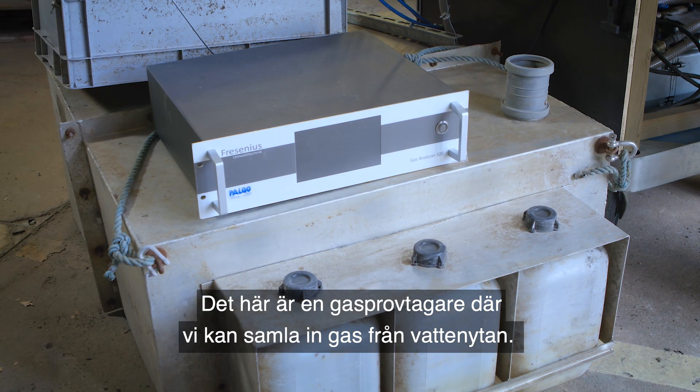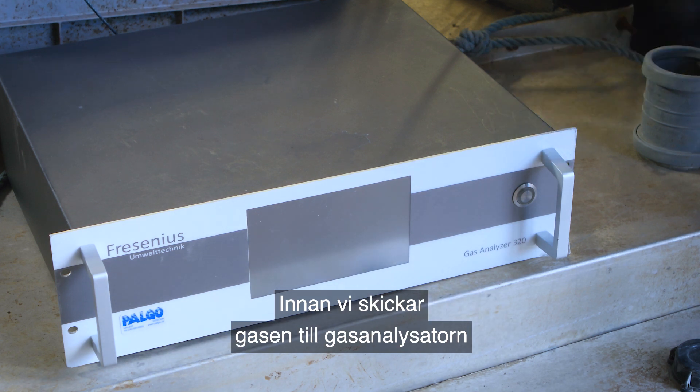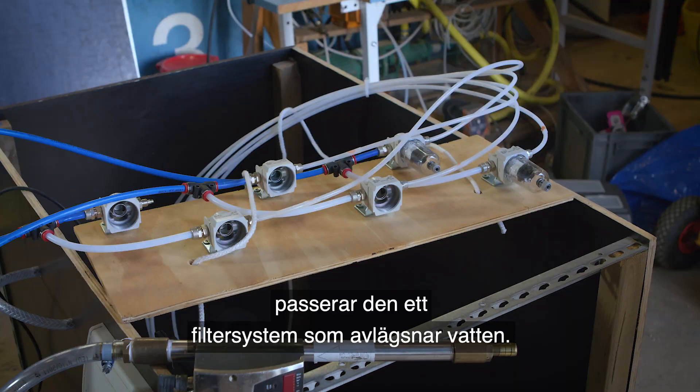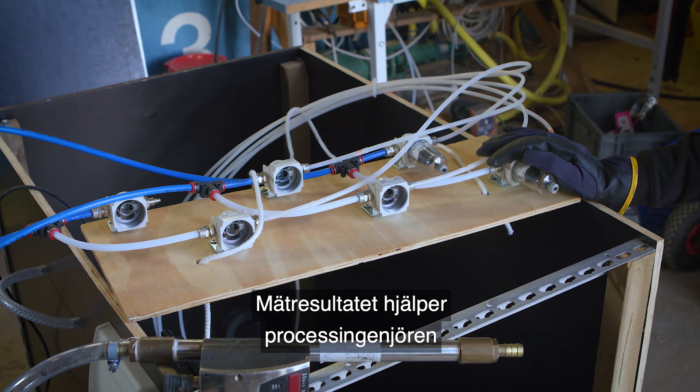This is a gas sampler where we can collect the gas from the water surface. Before we send the gas to the gas analyzer, the gas would go through the filter system to take away the water.